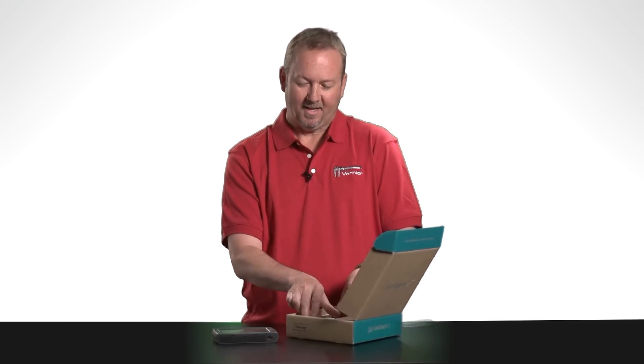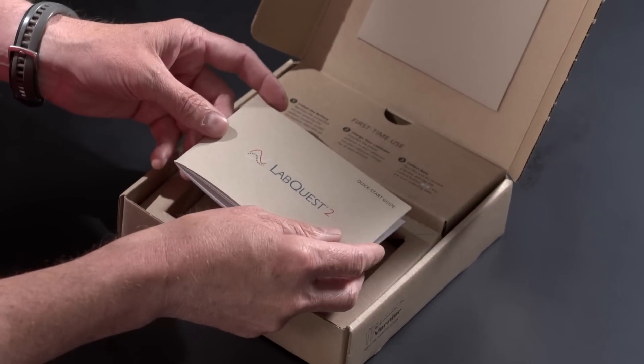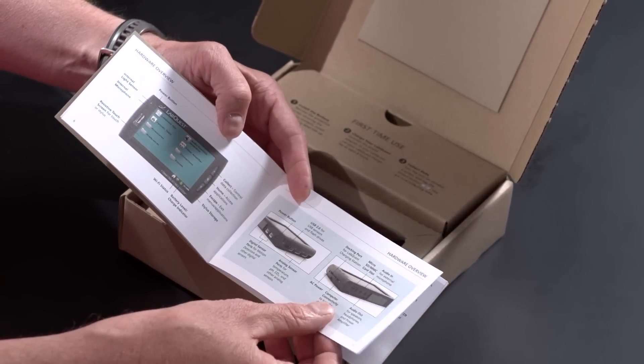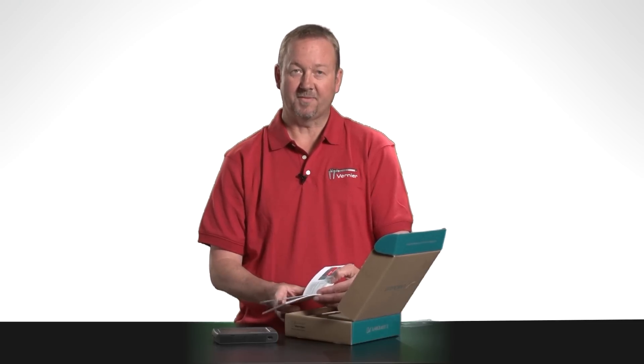Set that aside, and underneath LabQuest 2 is the Quick Start Guide. The Quick Start Guide contains very important information about LabQuest 2 and its many software data collection features.